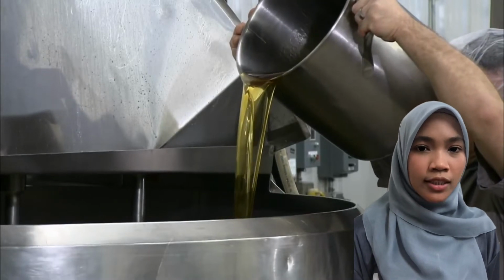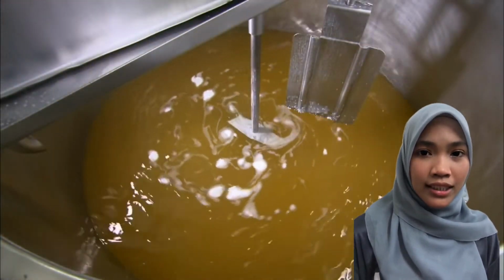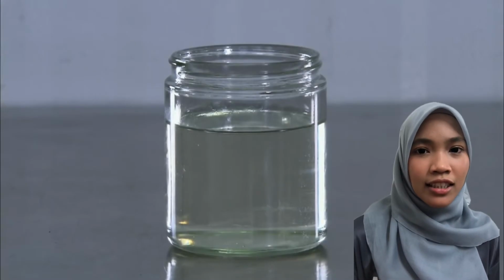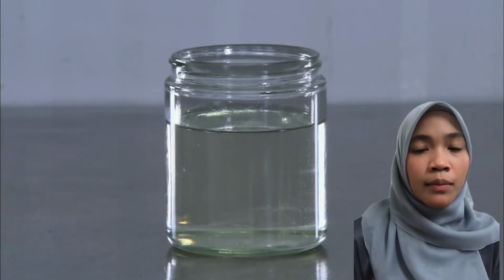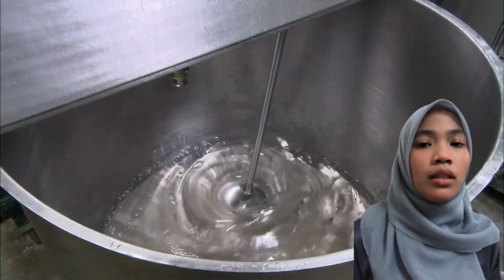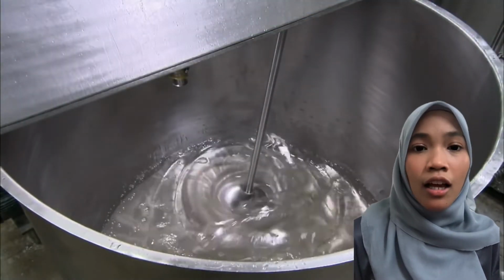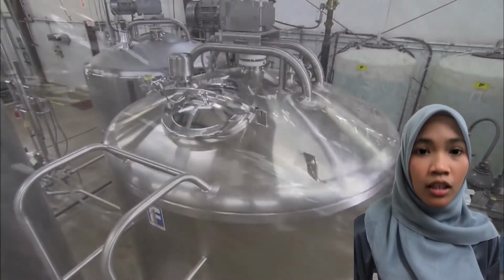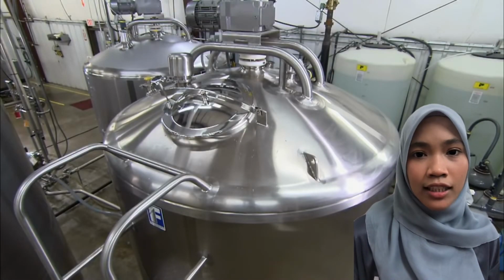Chromatography is so widespread, it can really be found in any field for any applications. But in case you are wondering if we really use the technique in cosmetics, the answer is a clear yes. But I suppose you will like more than a skin-deep explanation about how to use flash chromatography and preparative HPLC to produce sunscreen and eyeshadow.